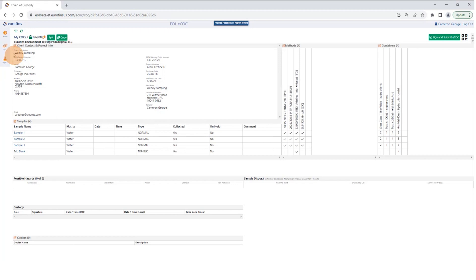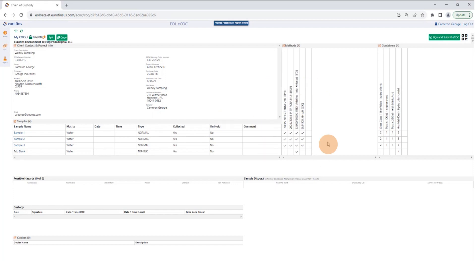Up here we have your client-specific and project-specific information. Down here are the sample names and IDs. Over here we have the methods pre-populated and everything's checked, and over here we have our containers already populated.